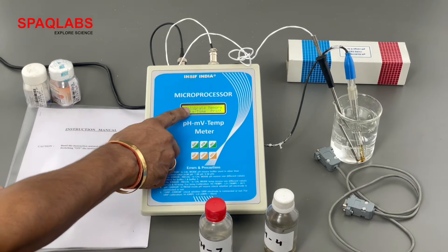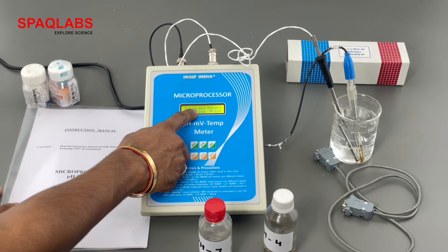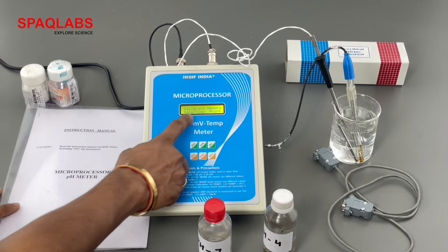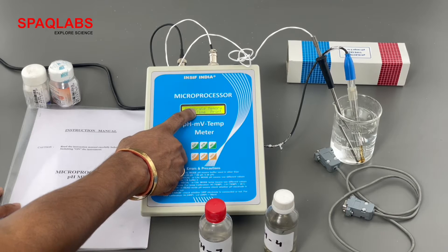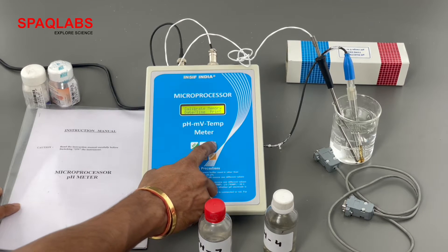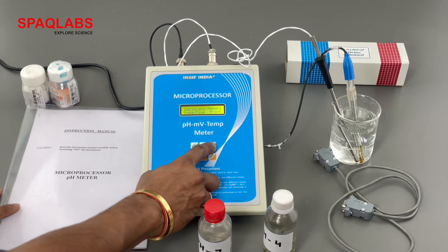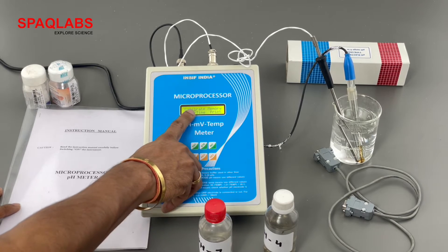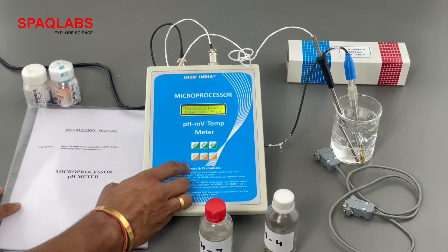Now there is a cursor below 'calibrate'. One can move this cursor from calibrate to memory, date and time, and print using the increase and decrease buttons. Right now we are going to do the calibration, so let's set the cursor below calibrate and press enter.